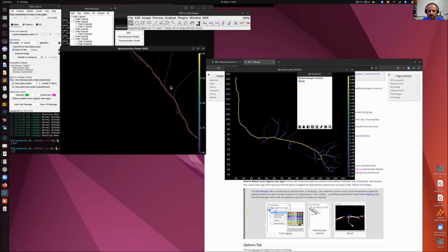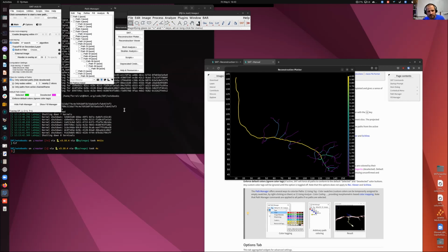So now we are in 3D, and we are going to work with the 3D viewer soon. So the idea is all the quantifications, an effort on being quantitative all the time: quantitative visualizations, the ability to select paths and make calculations on them, and then the ability to do some measurements.